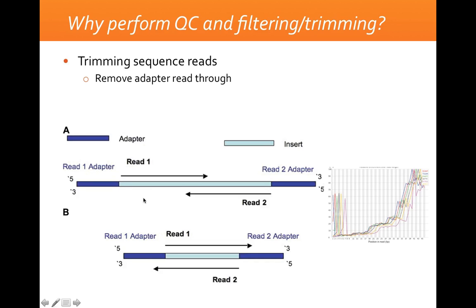The sequencing machine itself will remove the 5' adapter. It has built-in tools to remove the adapter in this end, but not when you enter the 3' end adapter. So that is something that you would have to remove manually if your library really contains a lot of short fragments.